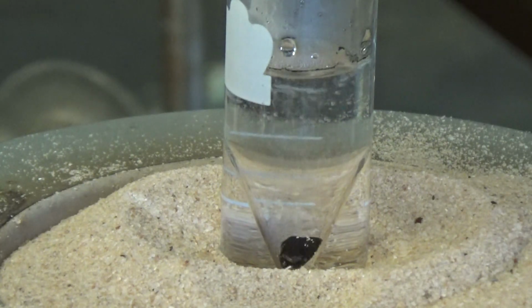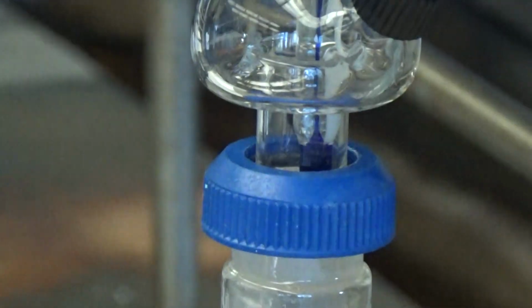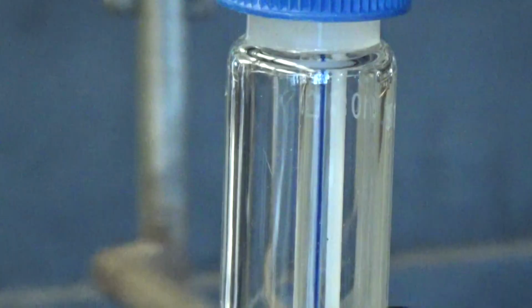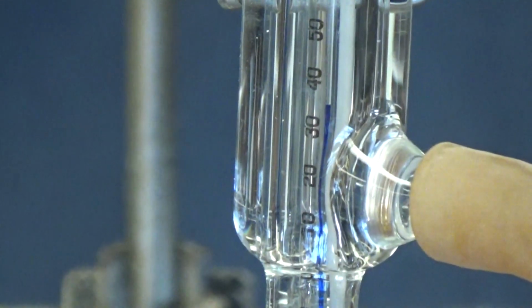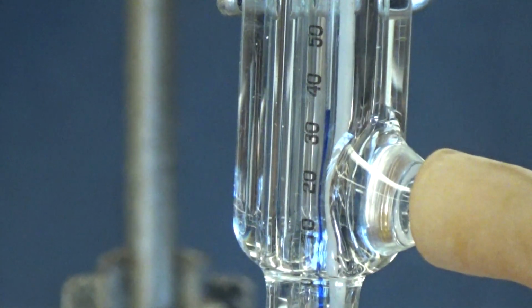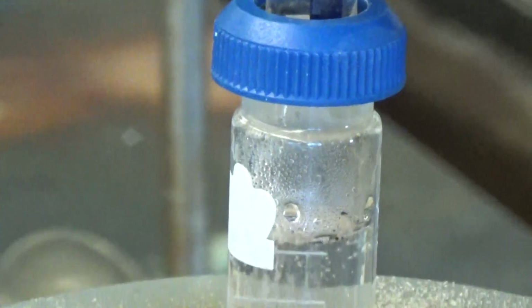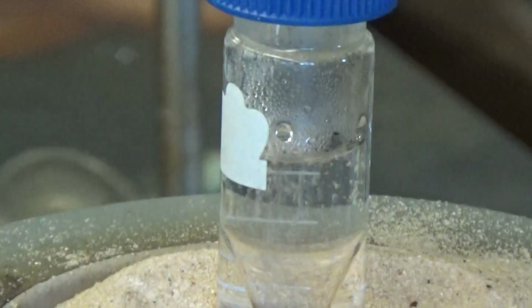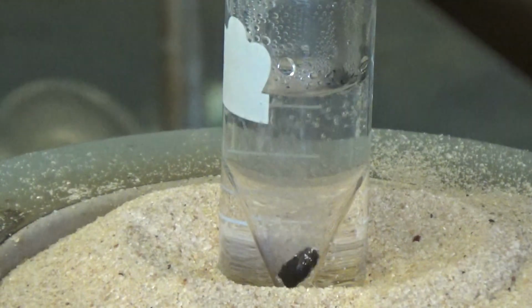It's boiling. No evidence of product yet. No, not yet. And the temperature on the thermometer, what does it say? It says 35. Yeah, 35. So that shows that where the thermometer is, it's not experiencing the high temperature yet, or boiling product. See, the boiling is going very well.